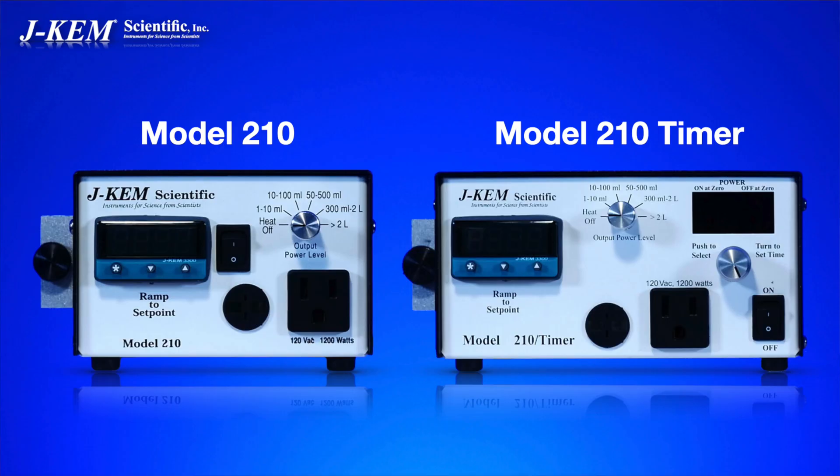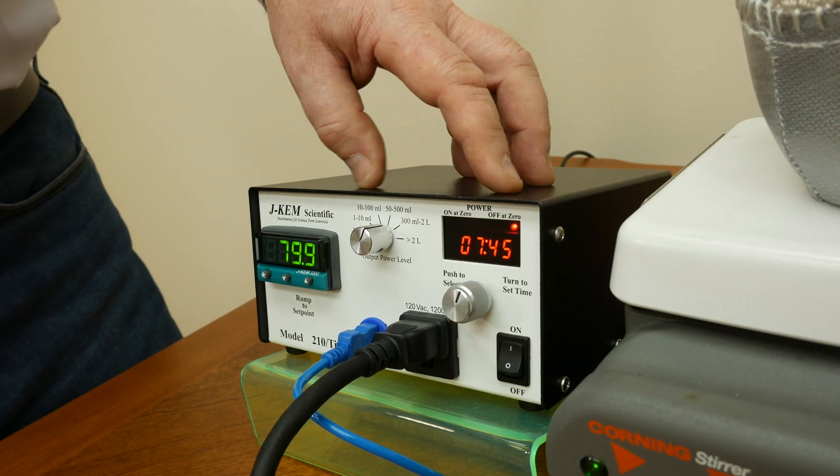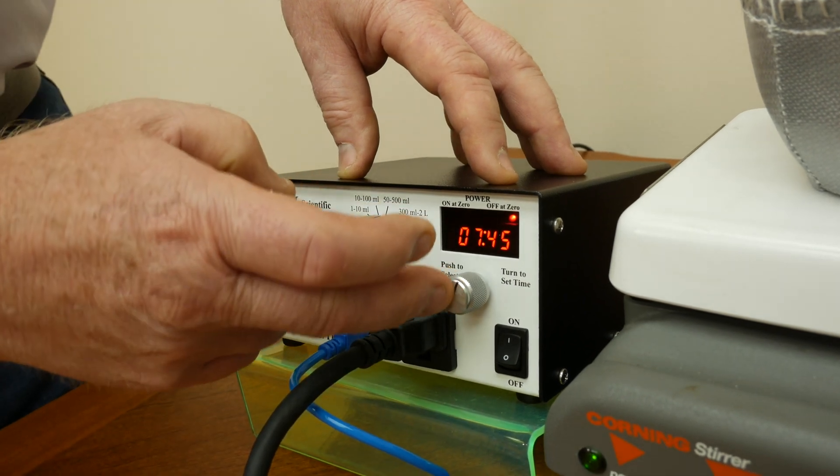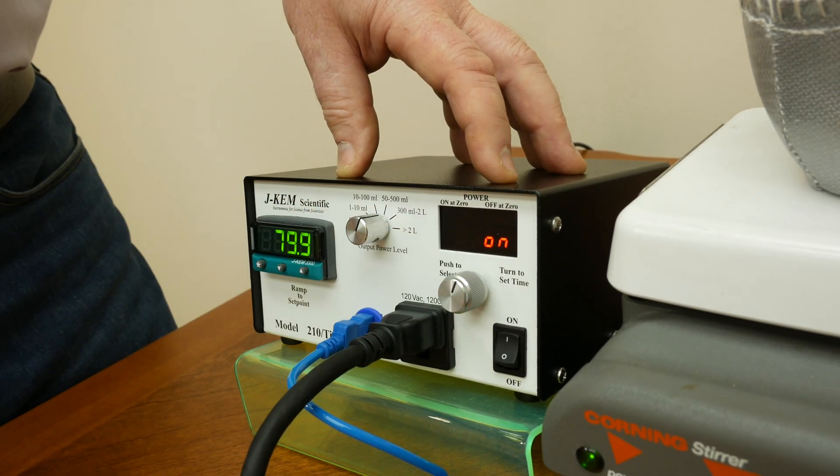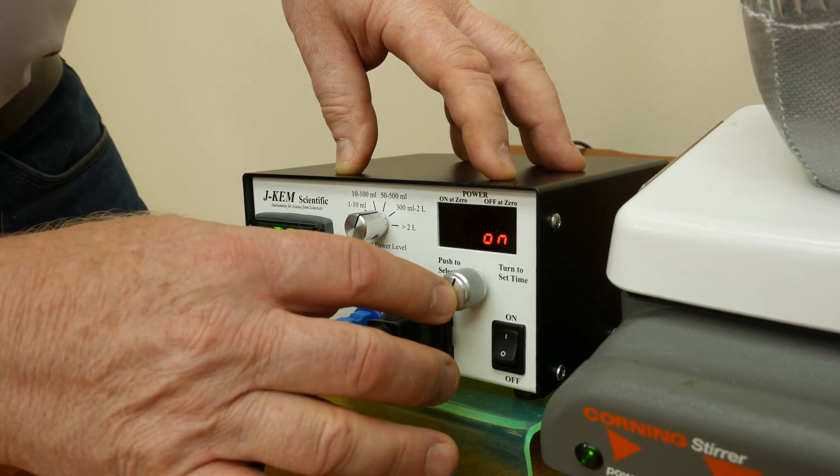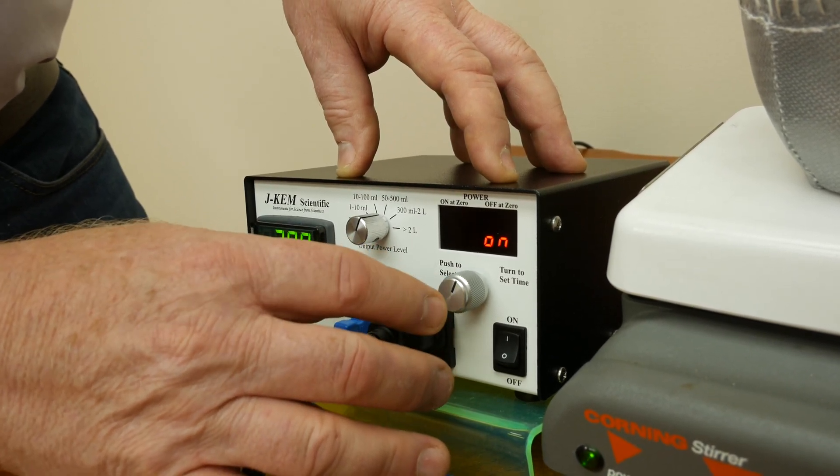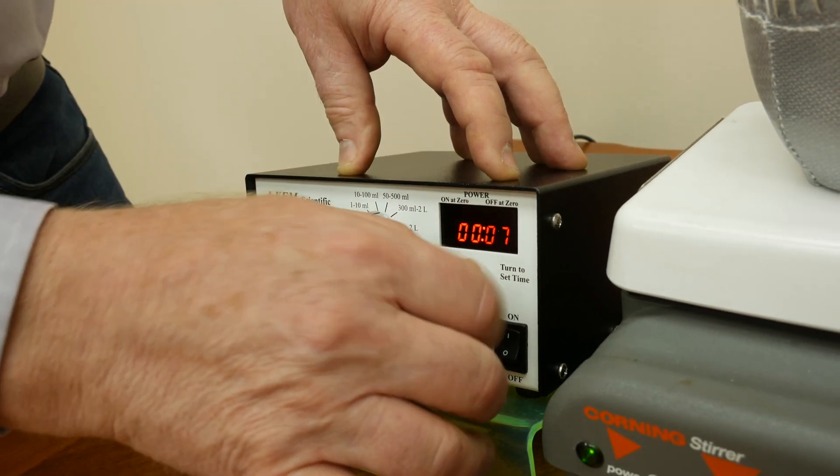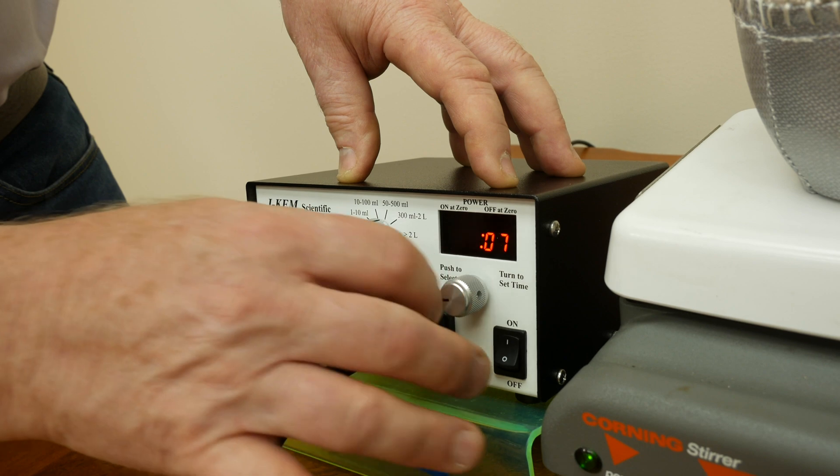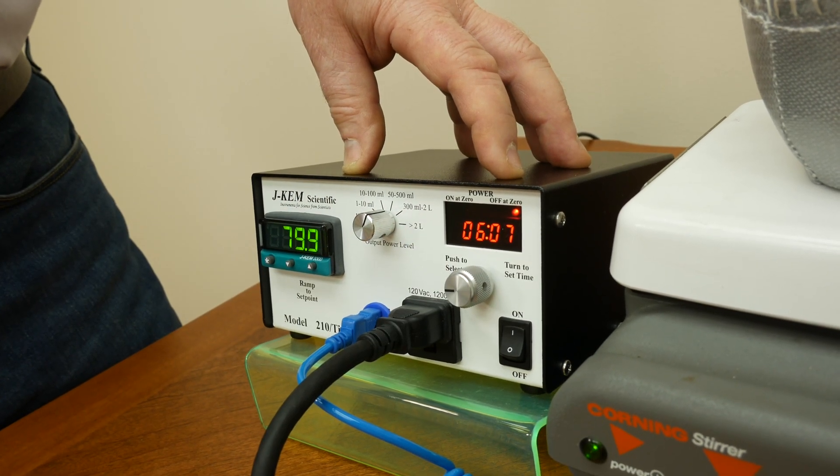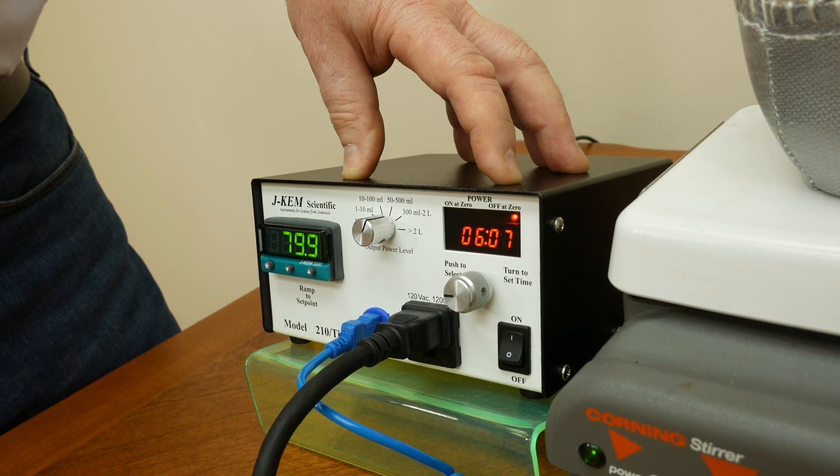Some of our models have timers and some do not. This one does. This is our model 210 timer. And so what it lets me do, I can either turn on power continuously in that case or I can set a time. So in this case now it's going to go off in six hours instead of minutes.